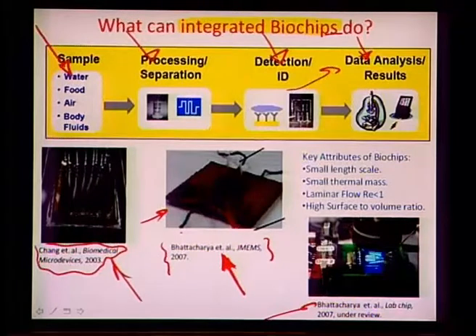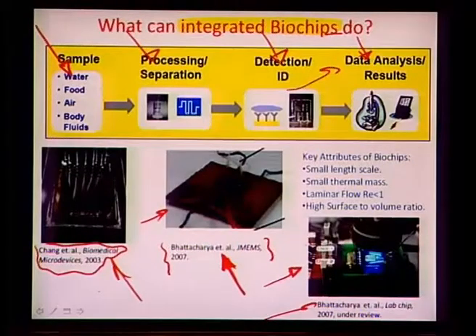This is another example of my own work, wherein we extended the technology that was already available in chip form to integrate two different processes, Dielectrophoresis (DEP) and PCR, or polymerase chain reaction. We found that we could go up to about 60 cells and do a successful real time PCR based identification using this protocol. We will illustrate time and again some of the work that has been done by various people, including me, around the world.